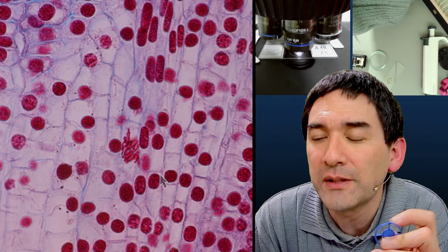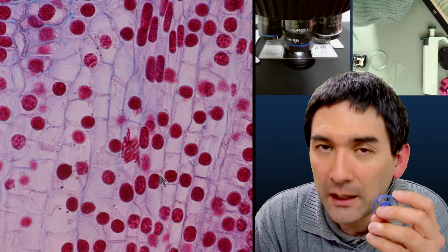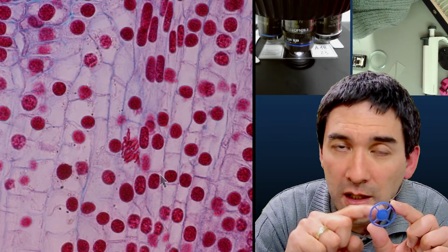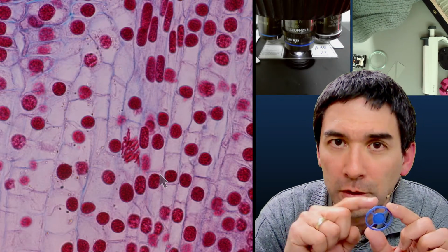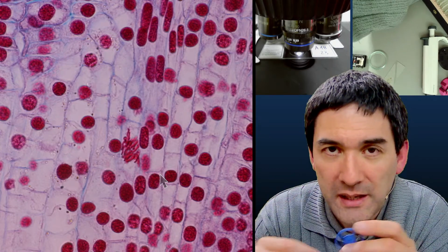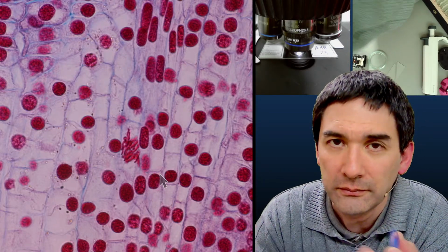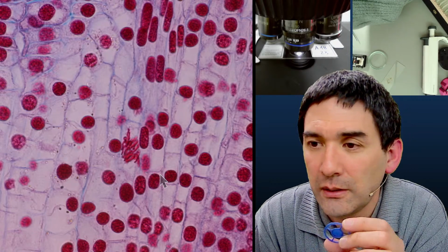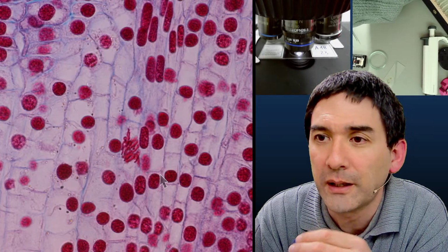Why I made my own dark field filters: it works for the 4x and 10x objective, but the background is white for the 40x and 100x objective. Yes, because the central patch stop was too small. If you want to get a dark background for the 40x, you have to make the patch stop larger, large enough that it will make the background dark, but because this reduces light overall, it's going to be generally darker. But I've actually managed to also get a very nice dark field for the 40x.